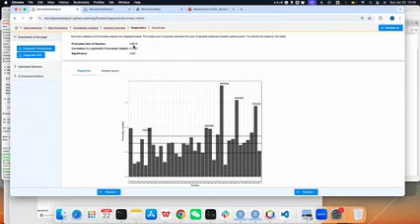This number actually means the misalignment between the data. If it's high, close to 1, it means the data are not aligned well, which means the microbiome and metabolomics data may not be aligned well according to the Procrustes analysis. You can also see the correlation of these two omics data. It's not too high, it's moderate.